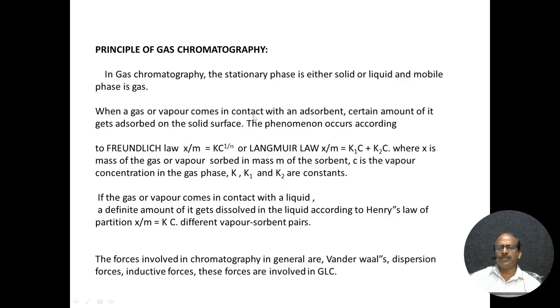What is the basic principle? Whenever the vapor is in contact with the adsorbent, a certain amount of gas is adsorbed on the solid surface. That is the phenomenon that occurs. How much gas is adsorbed in the solute is according to the Freundlich and Langmuir adsorption terms.